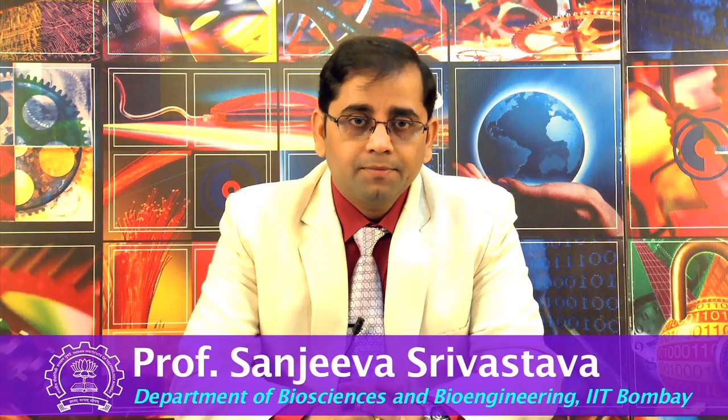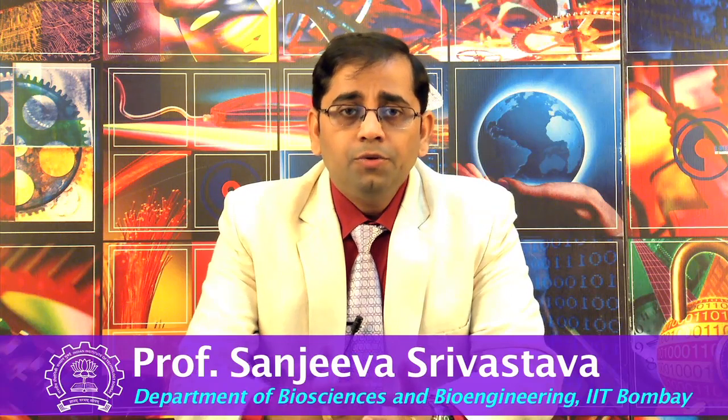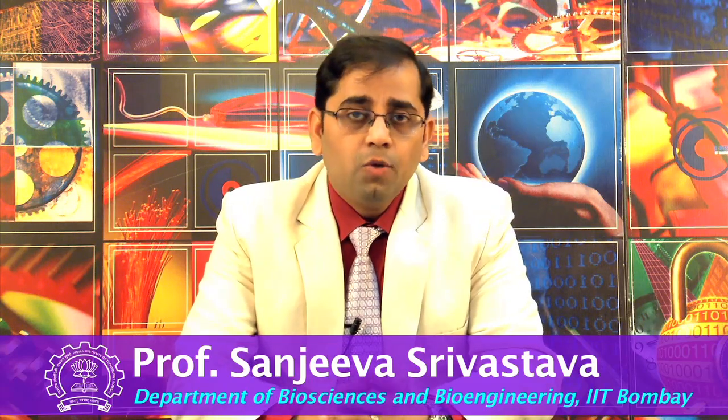In continuation of Dr. Omani's previous lectures, where he talked to you about the basics of reverse phase protein arrays, we are continuing to discuss this novel technology platform, RPPA, in today's lecture, where Dr. Omani is going to mainly focus on RPPA analyzer, which is a tool for RPPA data analysis and visualization. So, let me welcome again Dr. Ramesh Omani to continue his lecture and discussion on reverse phase protein arrays.